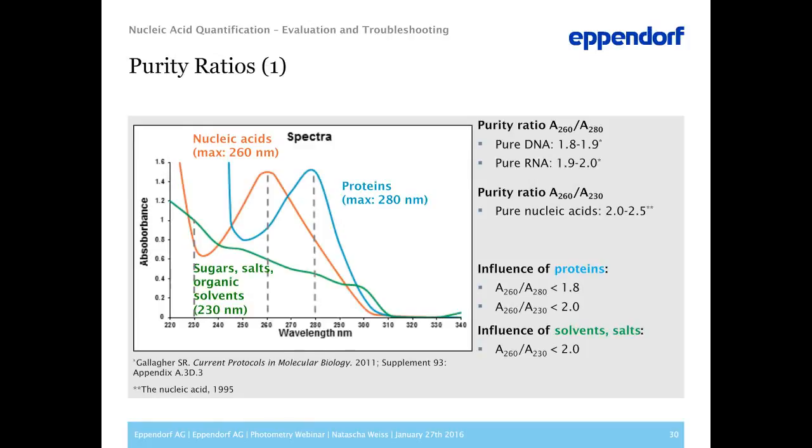Now we come to the purity ratios. In advance, I would like to say that different values are found in the literature regarding purity ratios of pure nucleic acid samples. One explanation for this fact is that samples are used which are resolved in different buffers, and the pH value of the buffer has an influence on the ratio.